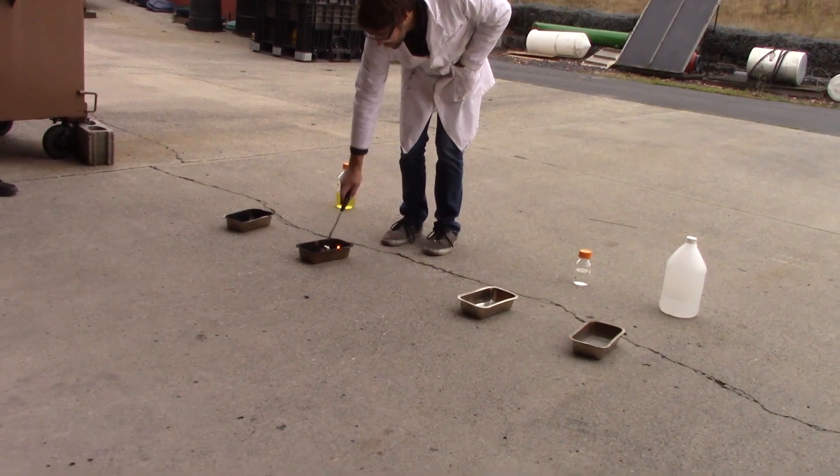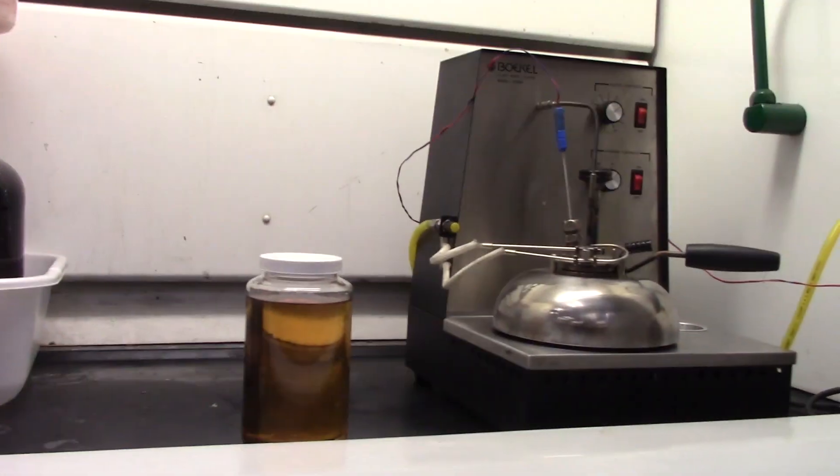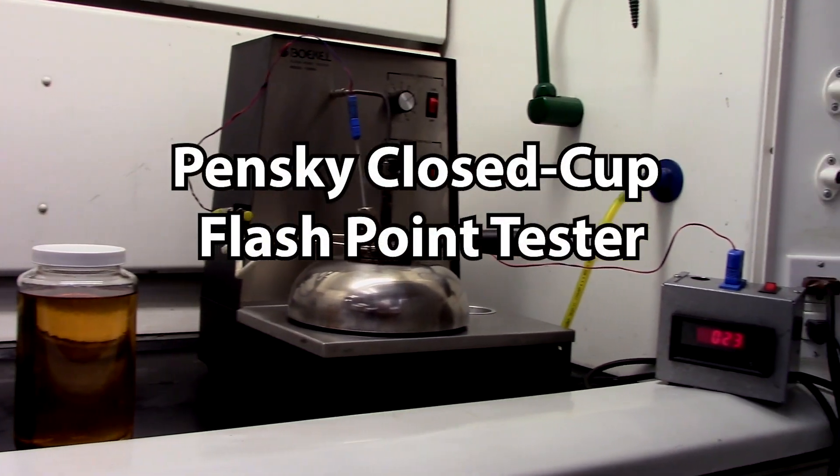The flashpoint of a fuel is the temperature at which the fuel begins to volatilize and will ignite. We determine this temperature with a Pensky Close Cup Flashpoint Tester.